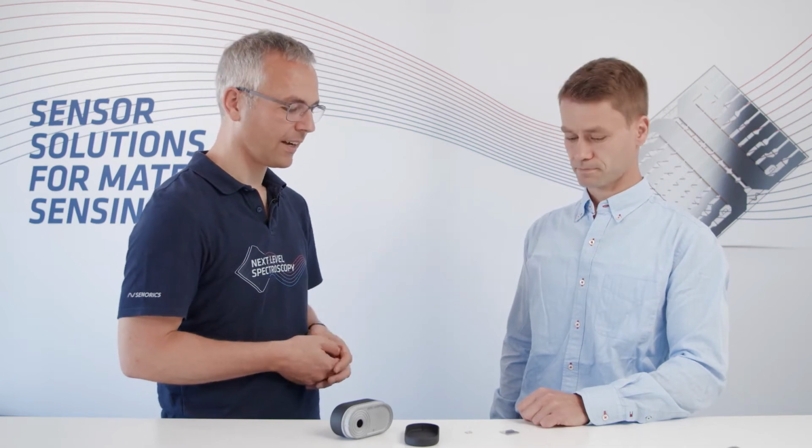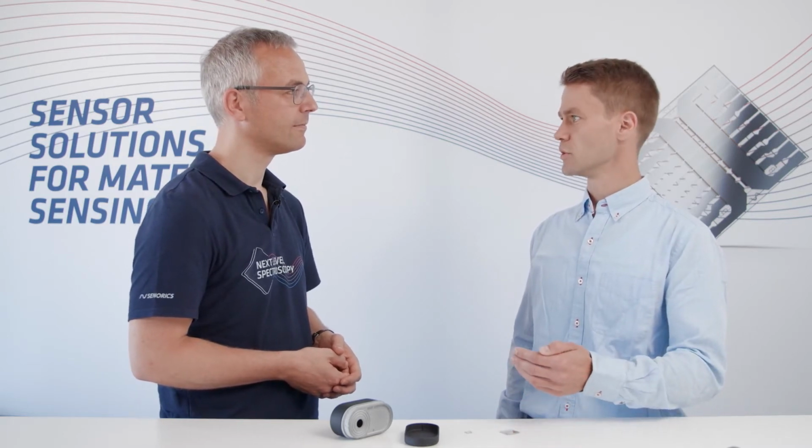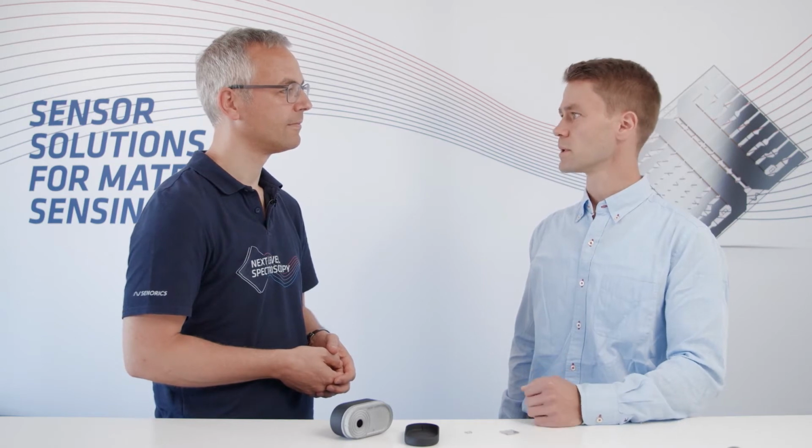One thing that is also worth mentioning is that this is not made of all the detector materials that we see on the market, but this is a very special combination. This is made of organic semiconductors. Can you dig a little deeper there? Right, organic semiconductors are known from display technology. For example, many smartphone displays are composed of organic materials, and they have advantages compared to other display technologies. But when it comes to sensing, it's very new to use organic materials.